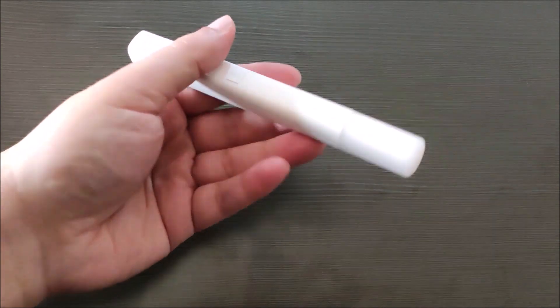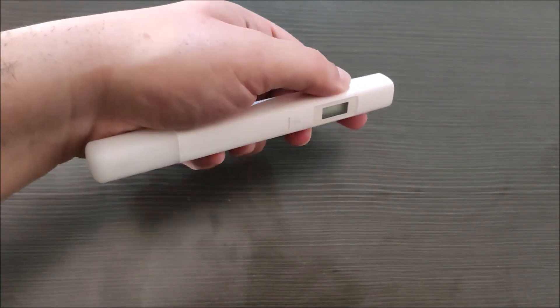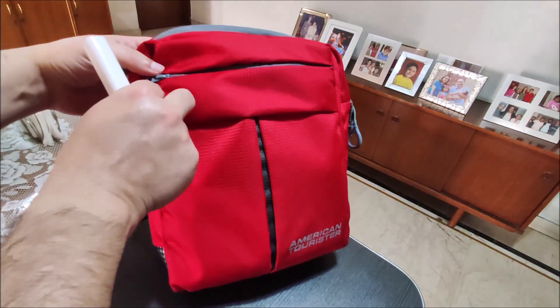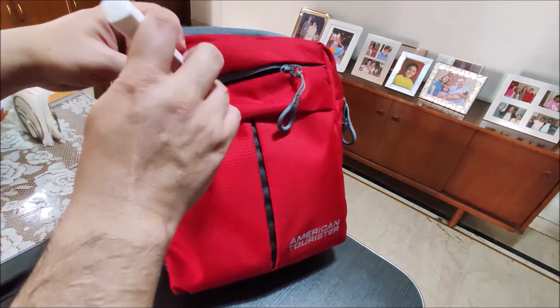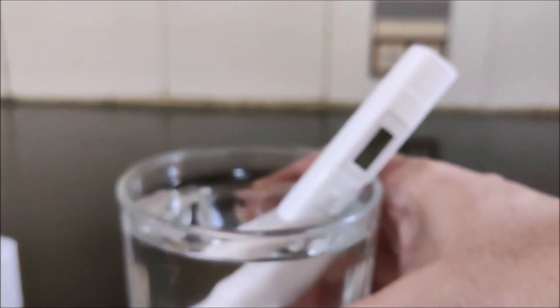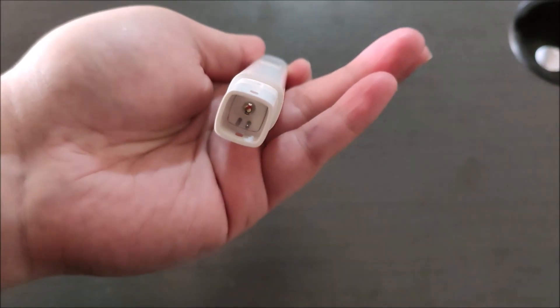The Mi Water TDS Tester is a slim, lightweight, and portable device. It weighs only 27 grams, which makes it ideal for taking while traveling. During travel, you can easily check the quality of water you are consuming. It has an anti-rust and anti-corrosion sensor.